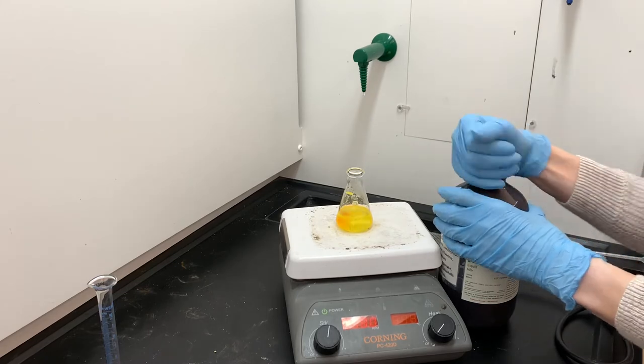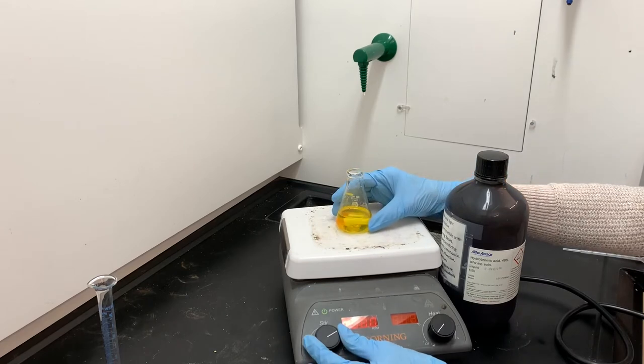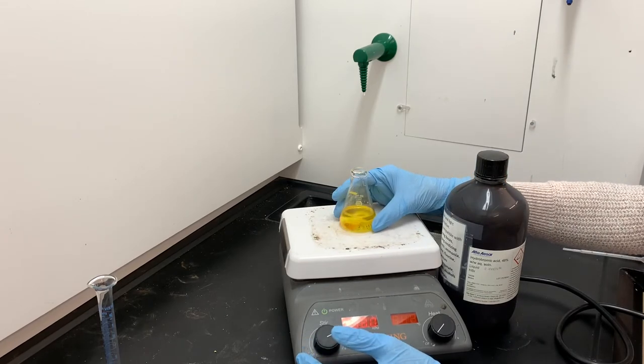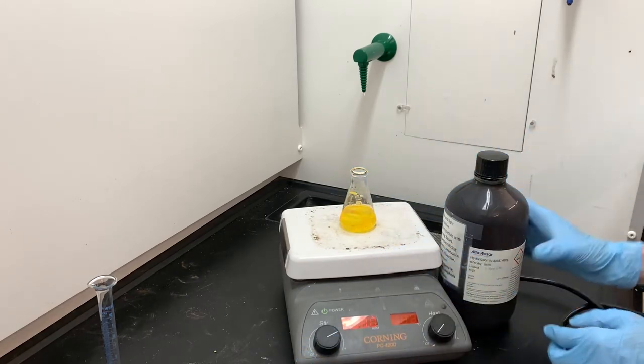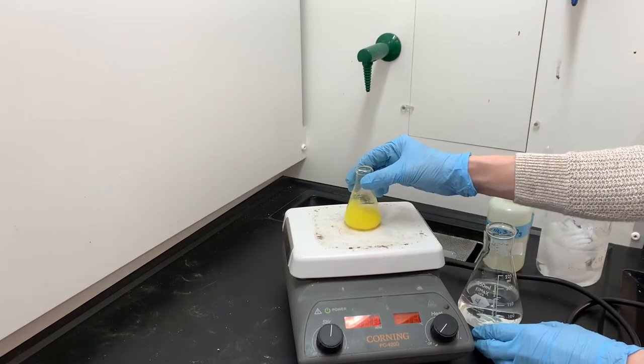So notice that orangey, yellowy color, that's the color of the bromine, which means that bromine is being successfully synthesized in situ and the reaction is able to take place. So the reaction is complete.